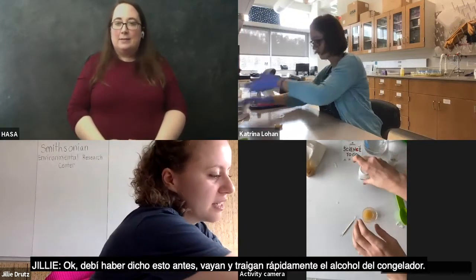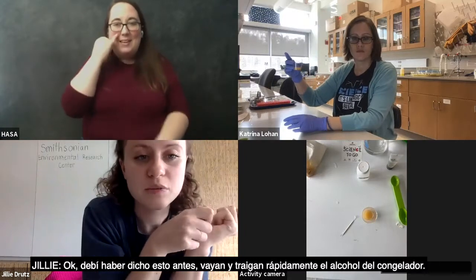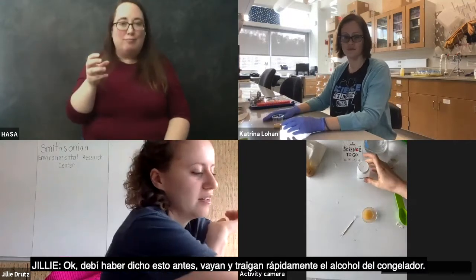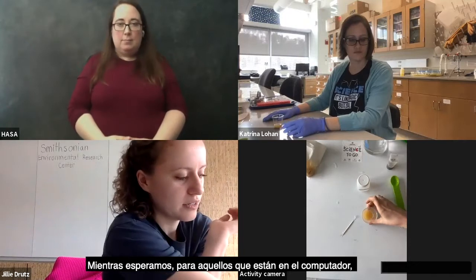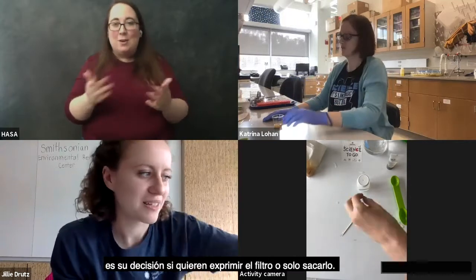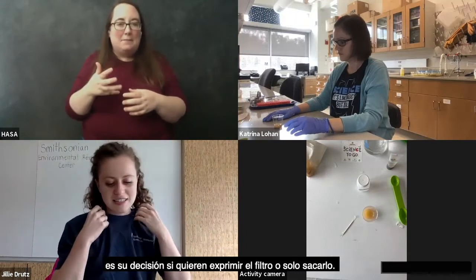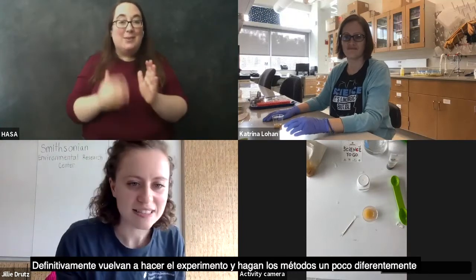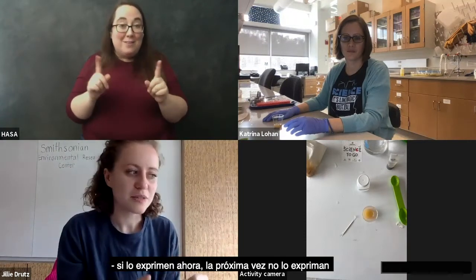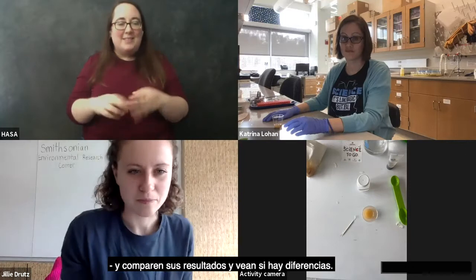Okay, so you can go ahead and, I should have said this before, but that's okay. If you haven't, go run and quickly grab your alcohol from the freezer or the ice bath. And while we're waiting for everyone to do that, for those of you who are still here, it's up to you if you want to squeeze your filter, or if you want to try it without. And definitely try this again and try your methods a little bit differently. If you're going to squeeze it now, next time don't, and compare your results. See how it looks different.